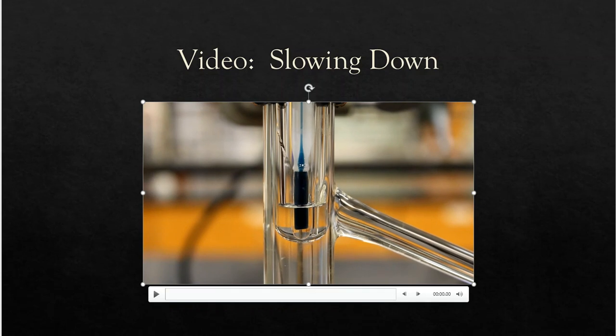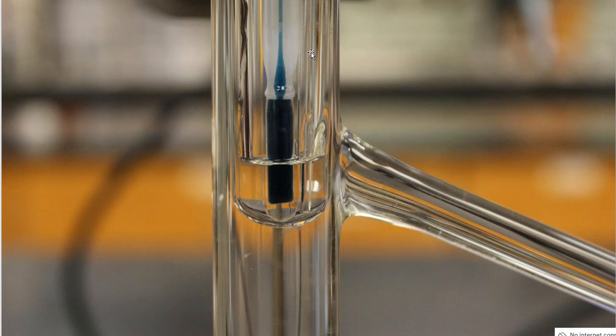Okay, so one of the things that you noticed in that video is that my stuff did boil away. Some of it did, right? I mean, in the beginning, I had enough liquid in here to cover the bulb of the thermometer at least. But throughout this process, because I hit it with some heat, that turned into a vapor and it escaped my test tube. All right, so I don't have as much, but it's still in there. The capillary's still submerged. I know it's not ideal for this thermometer, but I'm going to continue to wait until I see the very last bubble.